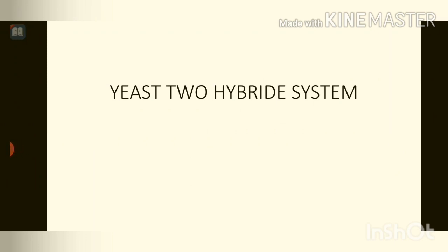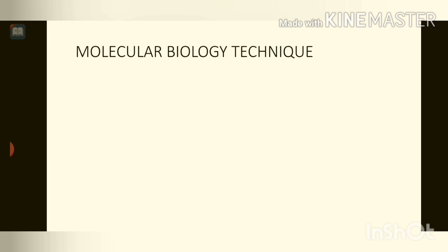Today's topic is the yeast two-hybrid system. It is a molecular biology technique. Why is it performed? It is performed to detect protein-protein interaction. Now the question arises, what is protein-protein interaction?